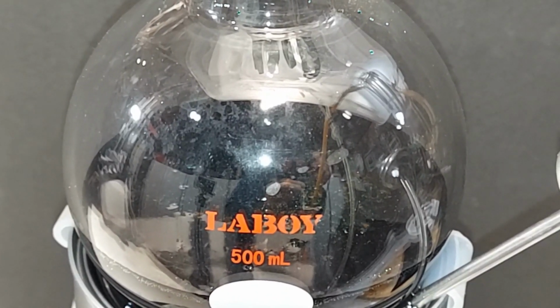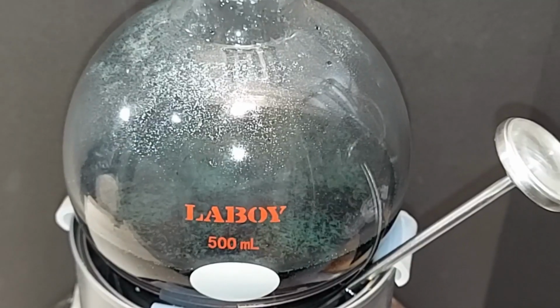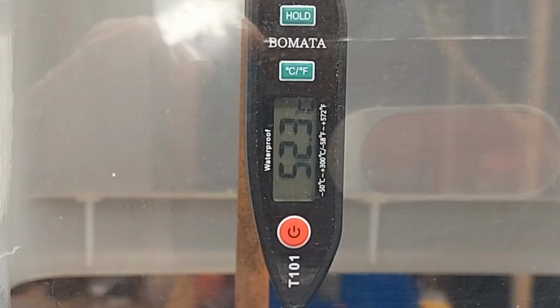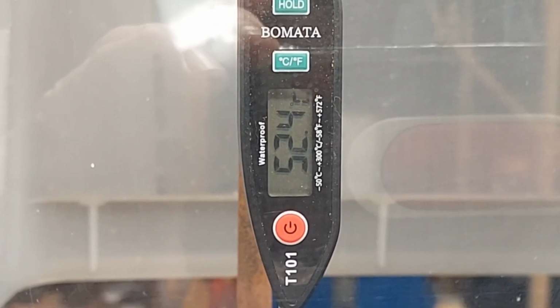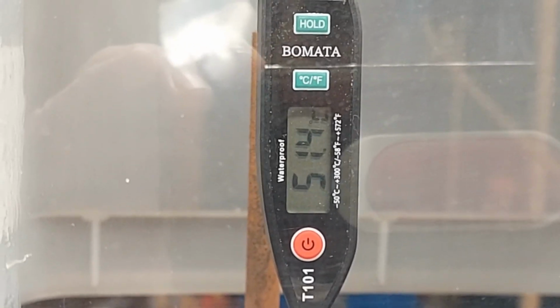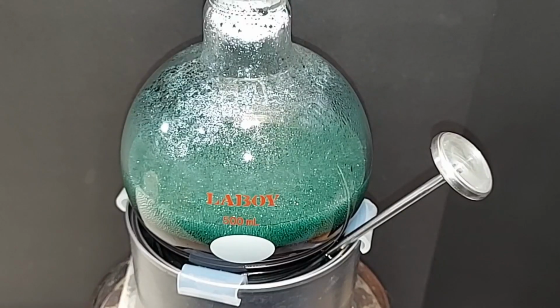It's not quite at the temperature we need, but we can already see some bubbling there. While trying to reposition the thermometer, I accidentally spilled some of the mineral oil, so we have smoke. Up on top here, we're at 52.4 degrees Celsius. Up and down it looks like a little bit, which this thermometer does, but we're definitely headed towards that 98 degrees Celsius. We're at our target temperature.